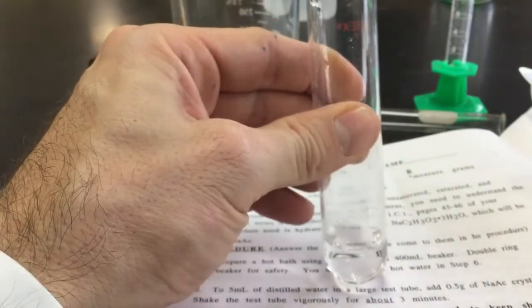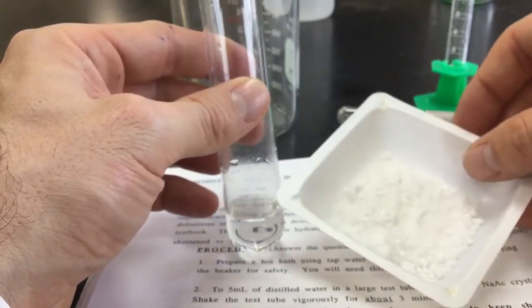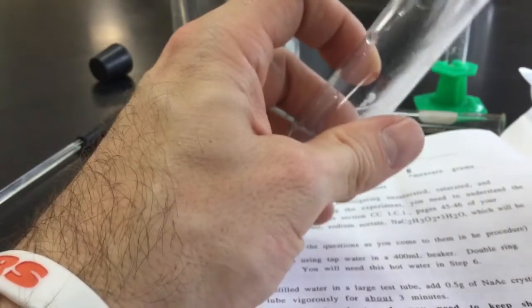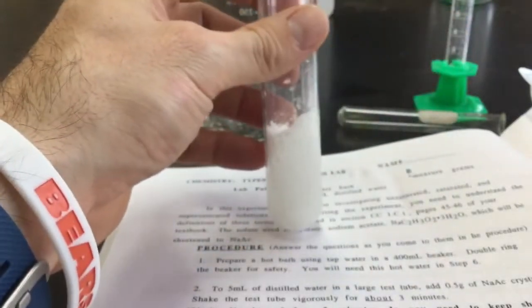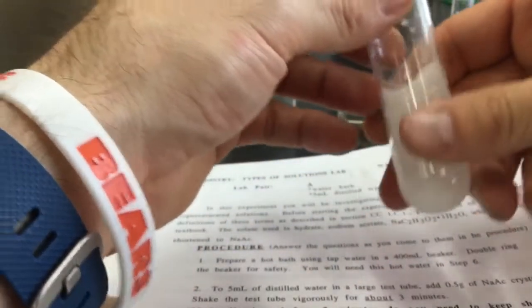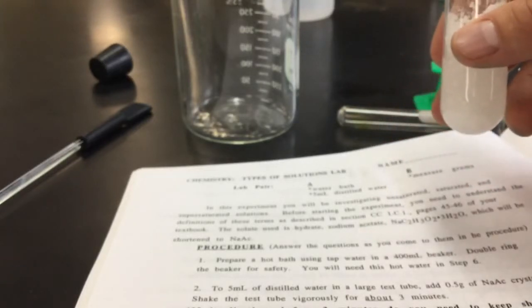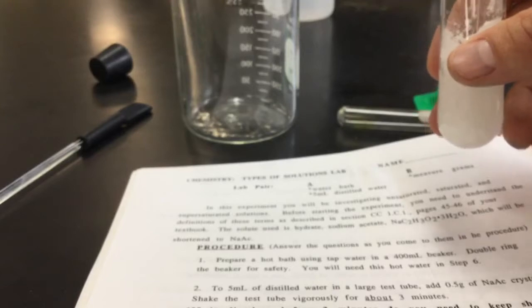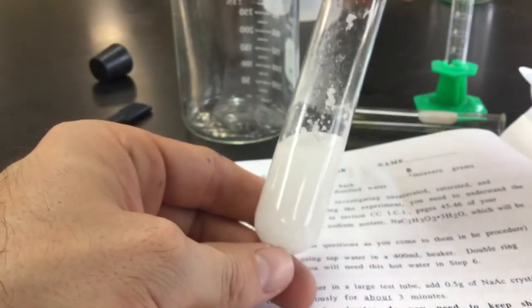The next step asks you to get 14 grams — and this is not a typo, that is 14 grams — which is a huge amount of sodium acetate. You're going to pour that into the gigantic test tube, which is one of the reasons why we're using such a large one. You should notice it'll be really cold to the touch, because sodium acetate is also used in ice cold packs.